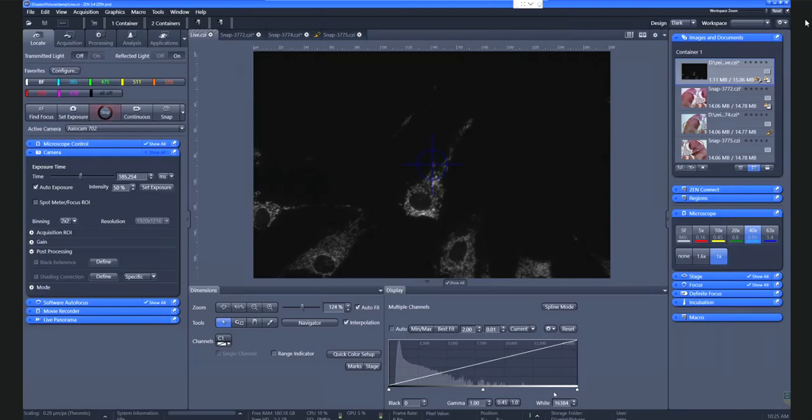The more dynamic a camera is able to deliver, the better. We can look at very, very bright spots at the same time as we can look at very, very dim spots. Just consider nerve tissue: sometimes the body of your nerve cell is very, very bright, but the synapses and the axons are quite dim. So to have everything properly displayed in a single snap, it's good to have this huge dynamic, and this allows us a lot of things we will talk about and see in the next minutes.